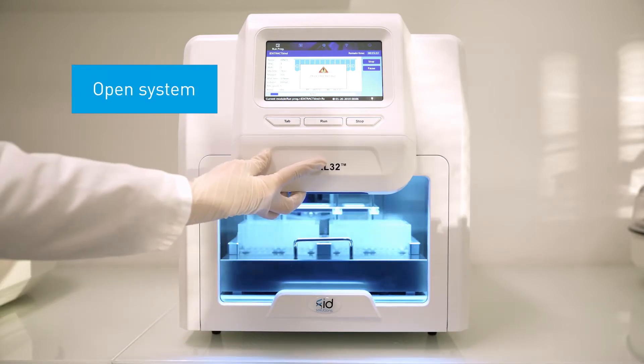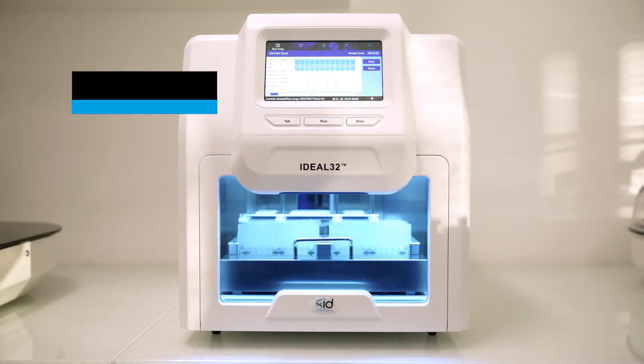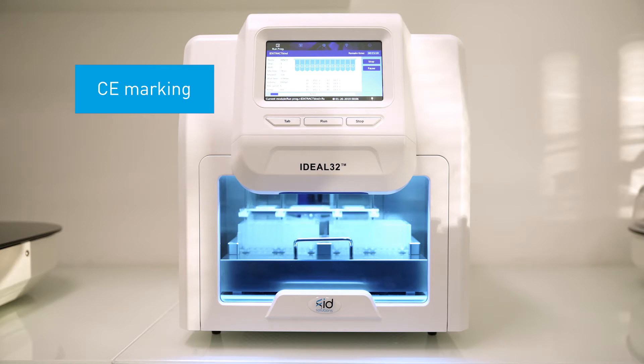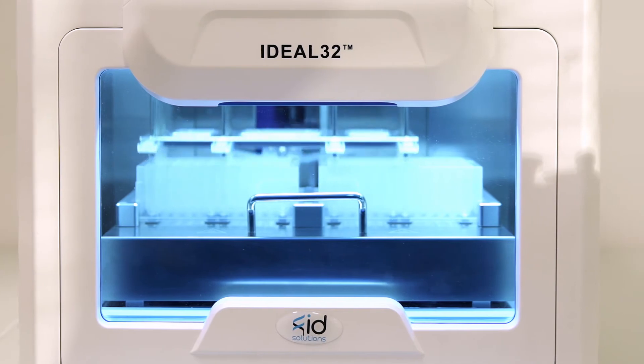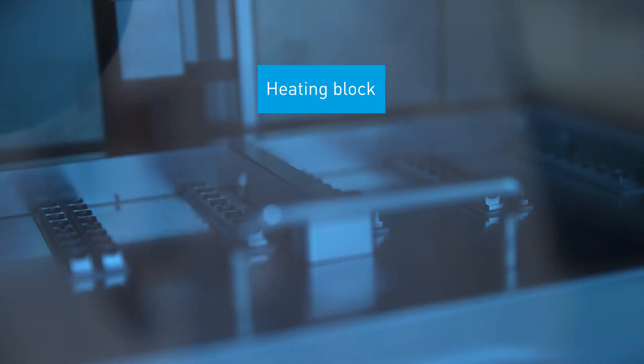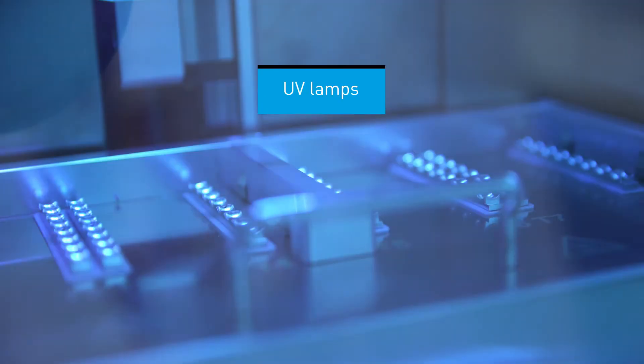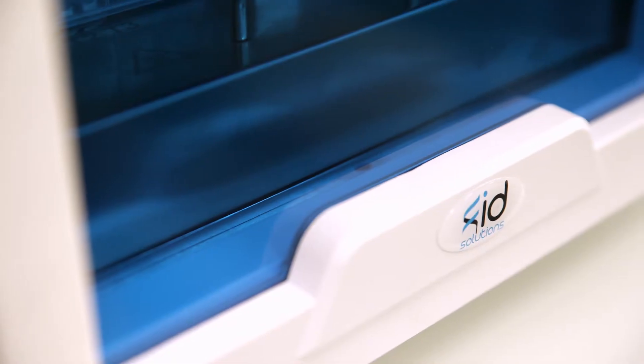The software is open with the possibility of simple programming and of course the machine is CE certified. The Ideal 32 robot has two additional options. A heating block may be used for the lysis and elution steps and UV lamps are included for decontamination.